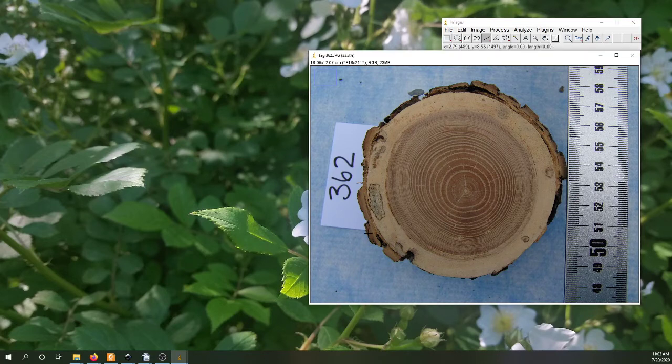So I've just used the length tool, so that measures a line. And so we could measure the width of this tree cookie, for example. Or you could make an oval, and then you can adjust that using each one of these handles. And you can get a pretty good measurement here. They can be fairly accurate and precise, as long as you work with them. So that may be useful if you're measuring area.